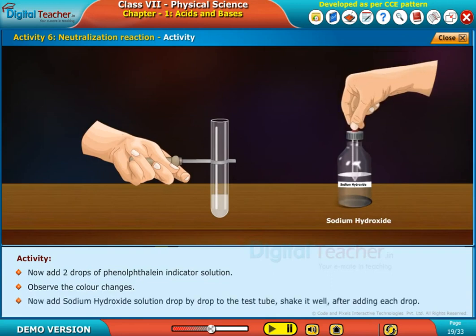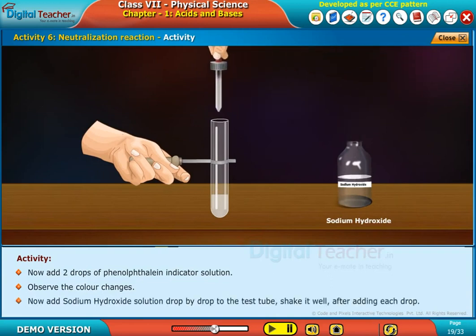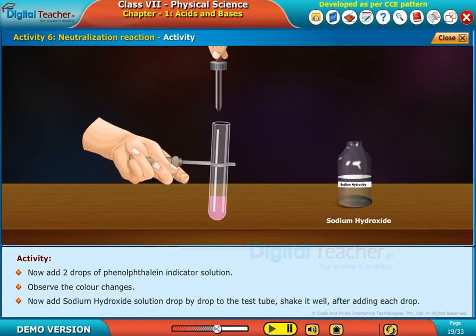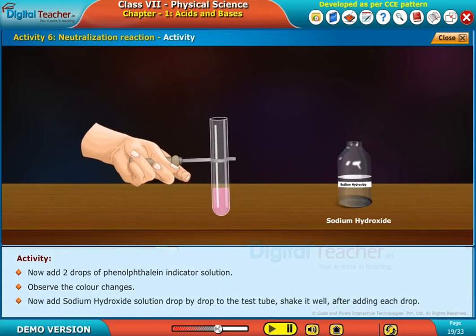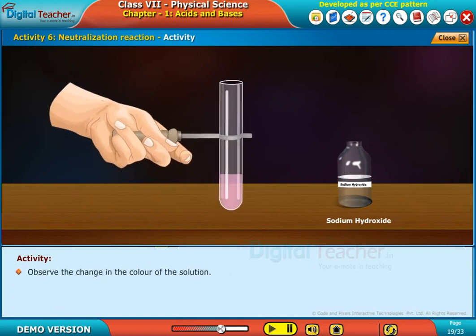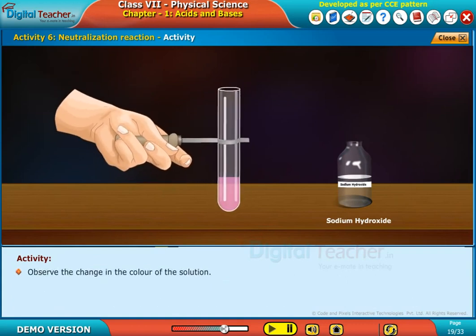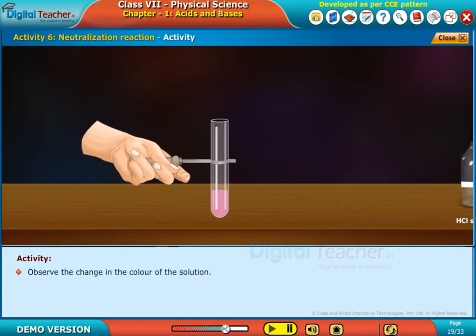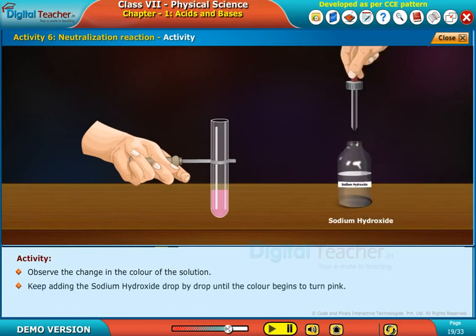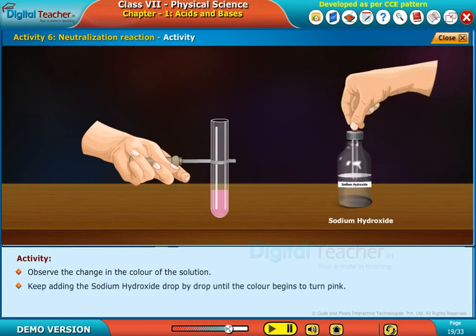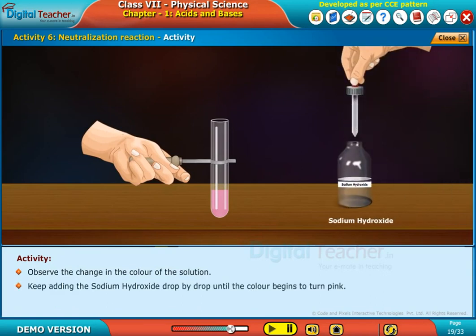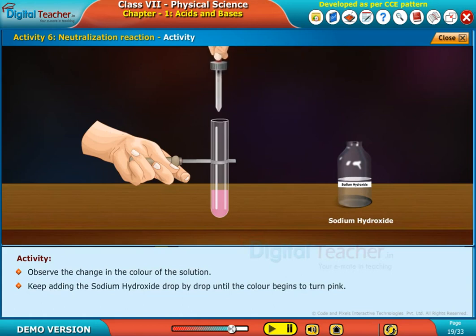Now, add sodium hydroxide solution drop by drop to the test tube. Shake it well after adding each drop. Observe the change in the color of the solution. Keep adding the sodium hydroxide drop by drop until the color begins to turn pink.